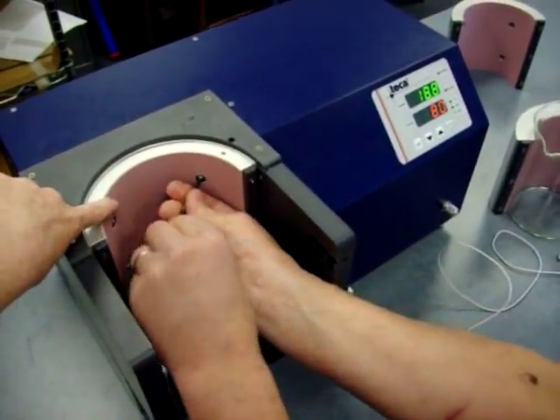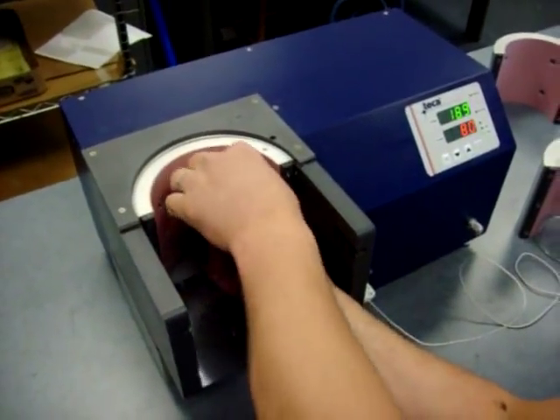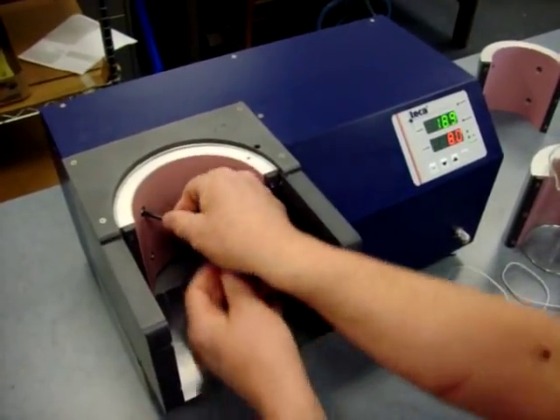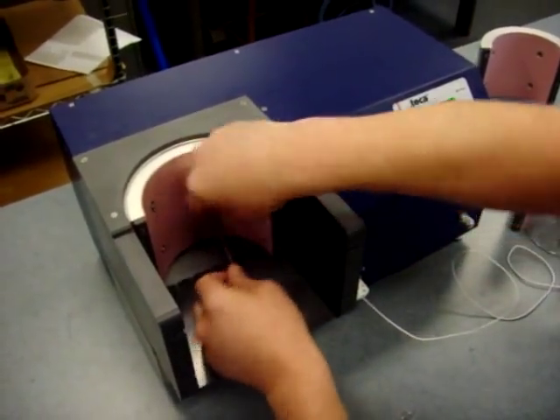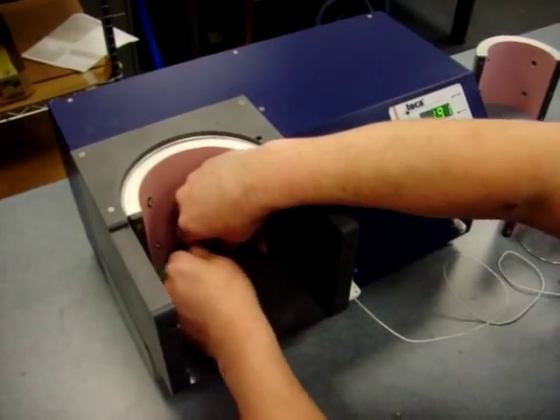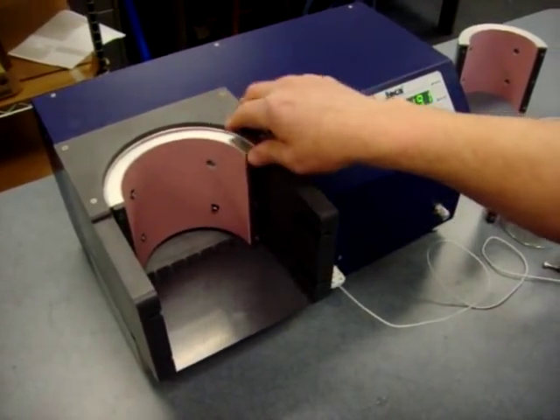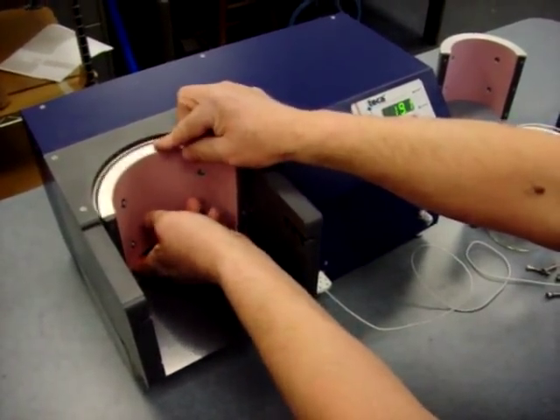What is this pink material that I see in the background? That's a material called gap pad made by Berquist. It's a soft heat transfer material often used in electronics to help them conform to the shape. In this case, it's helping us conform to the diameter of the bottle.